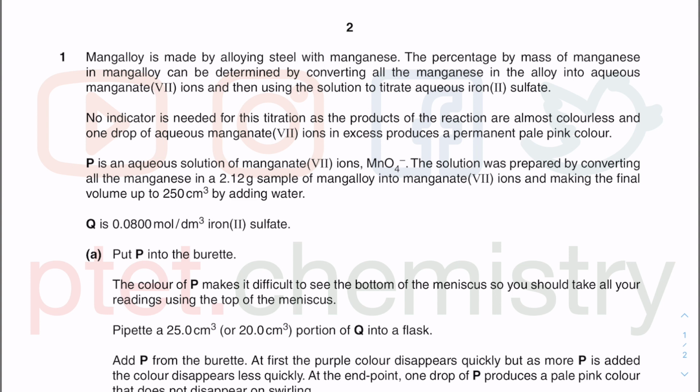So in this tutorial video, I'll go through this titration tutorial. It's a redox titration between this acidified manganate, which is MnO4-, where you have a -1 oxidation state for this ion. So it's MnO4-, -1 is the oxidation state of the overall ion. This is equal to the combination of the individual oxidation state for one manganese and also 4 oxygen.